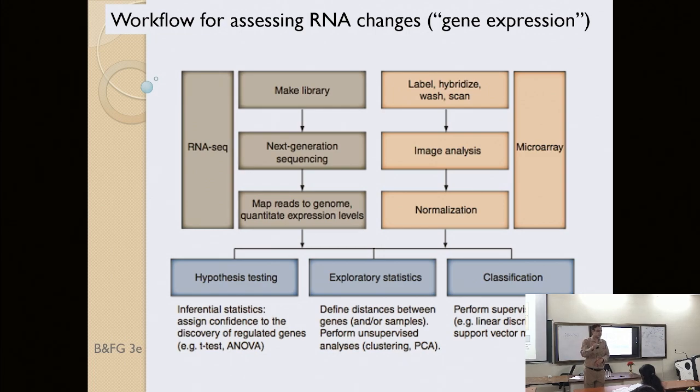So again, that's a hypothesis, because that is indicative of something not right, because in healthy it is 100, in me it is 1000. Okay, so this is what RNA-seq helps in inferring, basically quantifying the abundance of RNA transcripts in terms of the reads that are generated from this technology.